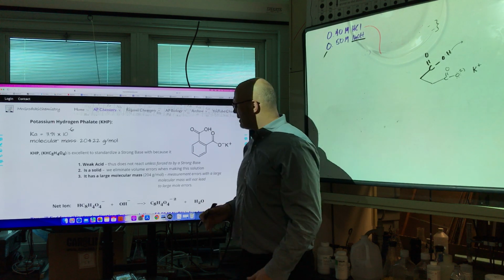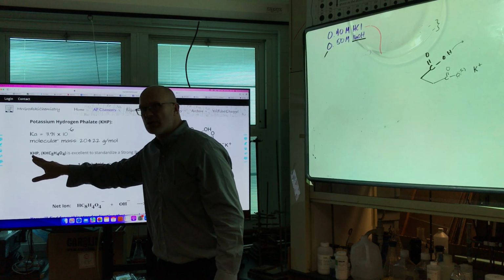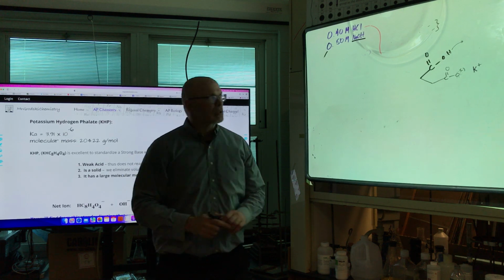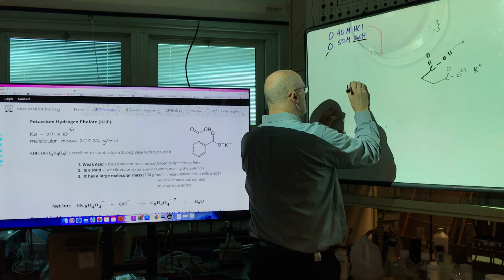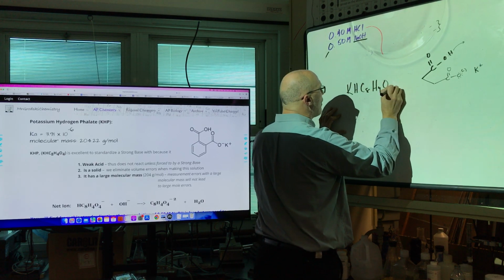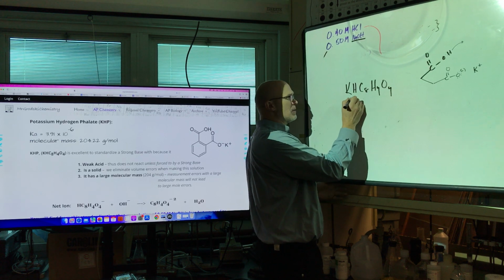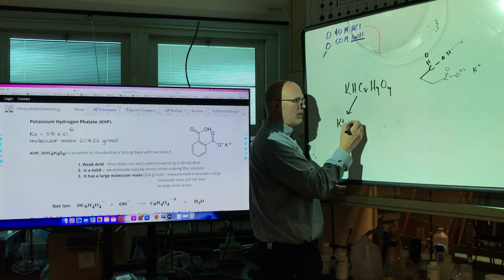So what happens when we dissolve KHP? What do you think is lost? If I write this here, KHC8H4O4, when I dissolve this, K plus is going to be a spectator. Some of you guys still don't get that.